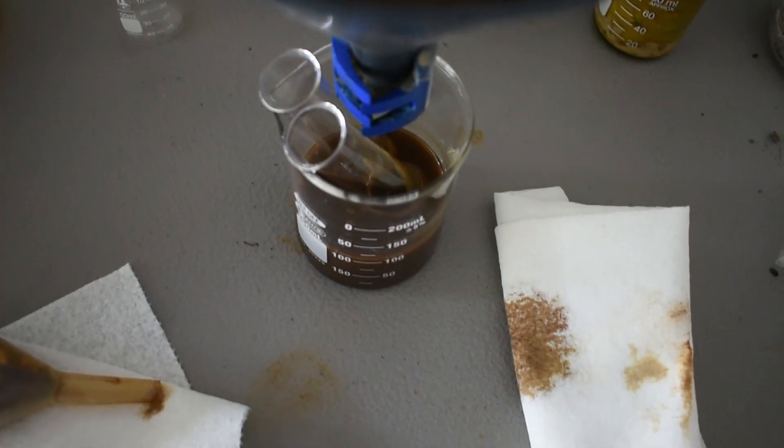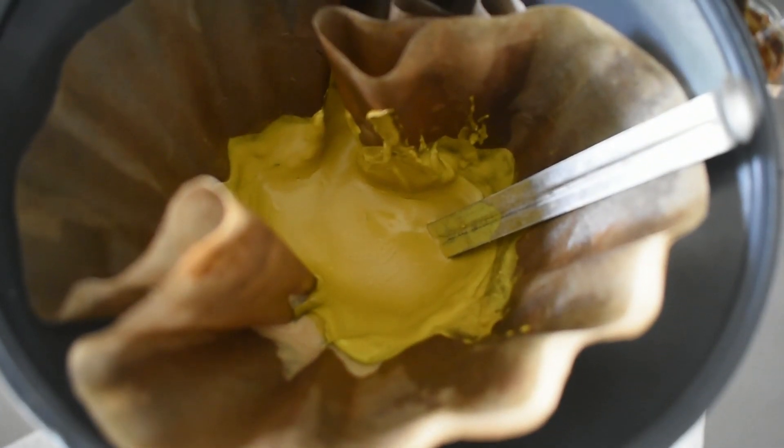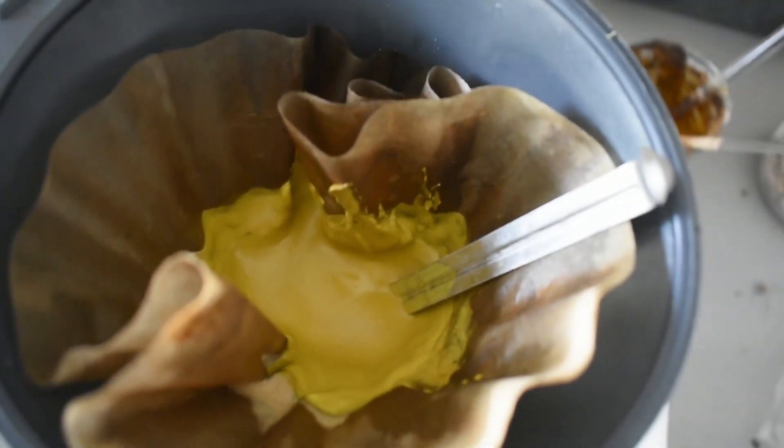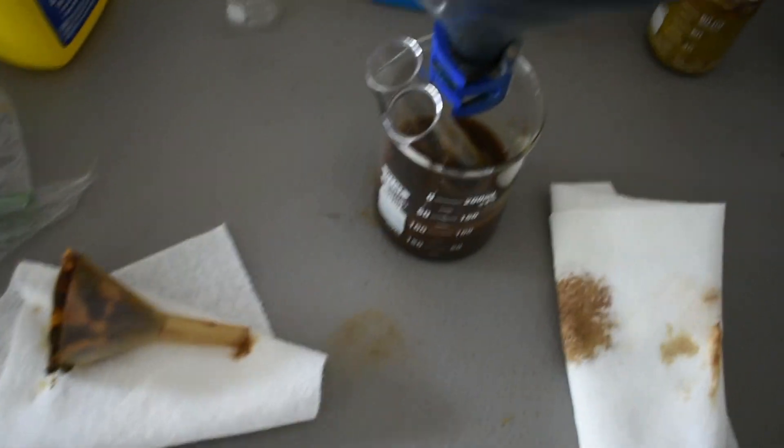So after washing with methanol and pyridine multiple times, I have finally gotten a product, which is quite yellow. It's not brown anymore. It looks pretty good. As you can see, I kind of made a mess in doing so. A lot of the oxidized stuff came down.